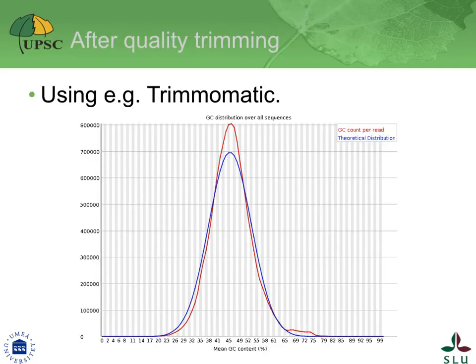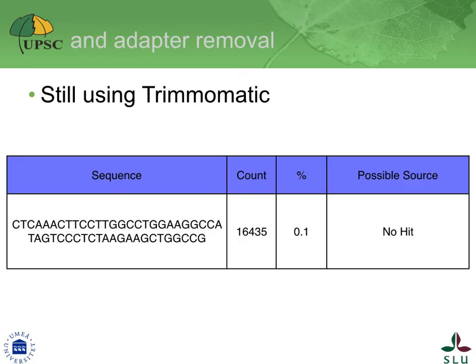Back to our example: we have seen that Trimmomatic helped correct some of the observed bias. However, it did not affect the putative anomaly observed in the GC distribution. Neither did it remove the unknown sequence. It did, however, succeed in removing the adapters. How should we go about the unknown sequence? Take a minute to think about how you would approach it.